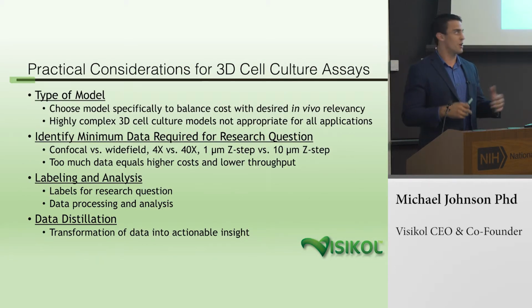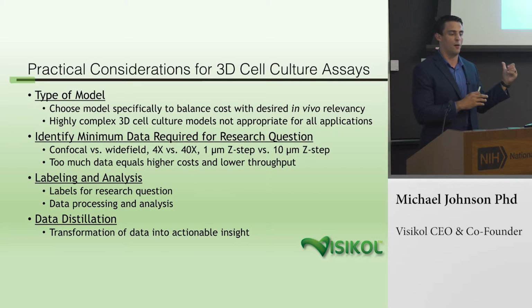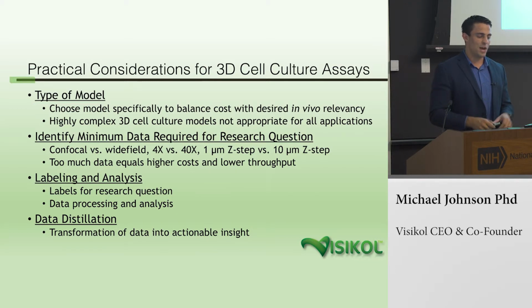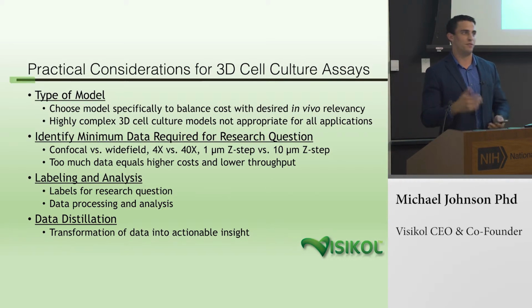Now, as a contract research organization, we find it really, really important to stress the details with all of our clients. I think this is important for anyone developing an assay in this space, is to stress the details on what kind of data we're going after and the type of model. These are the questions we always ask clients that we're working with. I think are always really important to run through. But as a type of model that you're going after, we have highly complex 3D models that are out there. They're thousands of dollars per well plate. We have models that we can generate for $50 to $100 per well plate and everything in between.